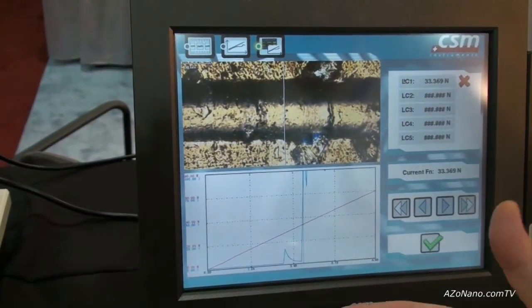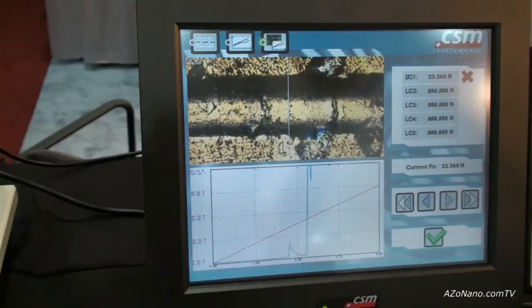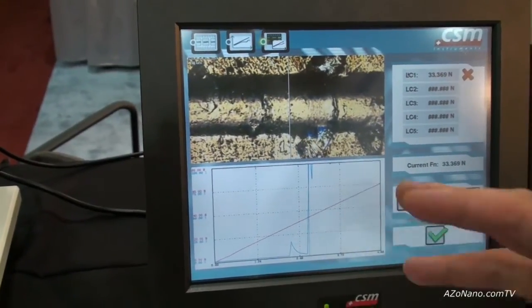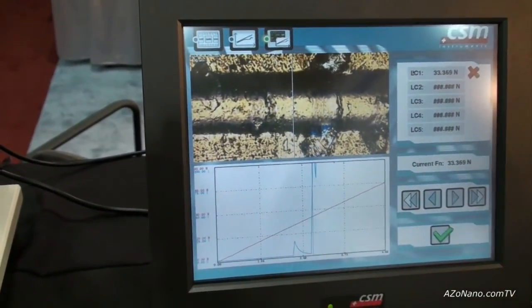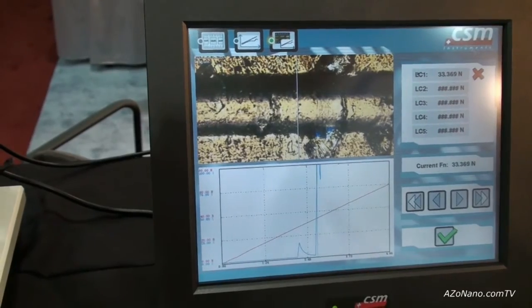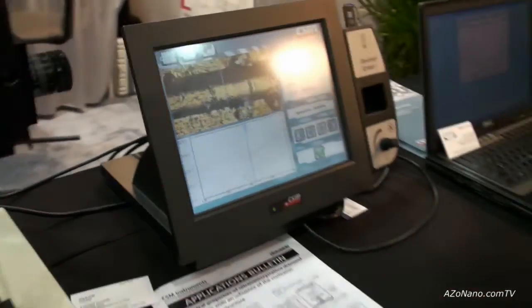And that's the basic test. So for industry they're not concerned with a lot of bells and whistles, they just want a simple tool. They can put their sample on, do a simple test at a technical level and get a number. And the quantitative number is how you can compare between different types of coating, different kinds of process and improve your process control.